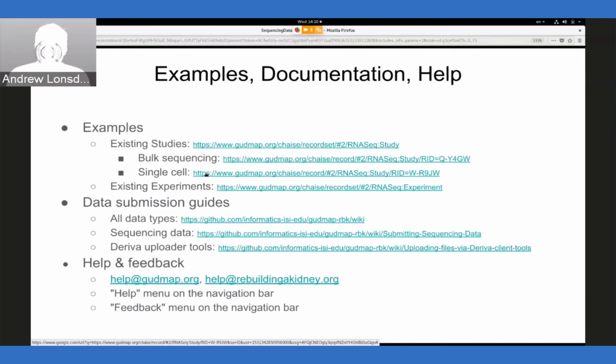For the non-technical users, you can do the checksums in the export. That'll be a massive leap. Well, that's a good idea, actually. Yeah, that'd be easy. We do have the checksum and all that. You're talking about the MD5 checksum, right? Yeah, we do have all that currently in the record associated with the files.